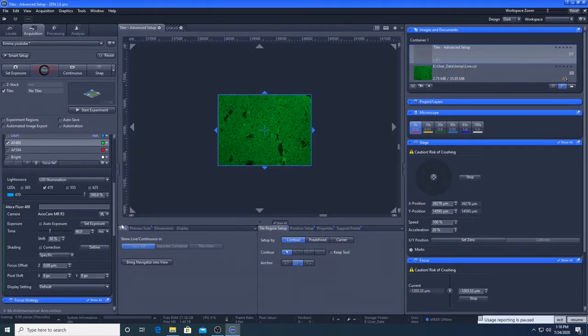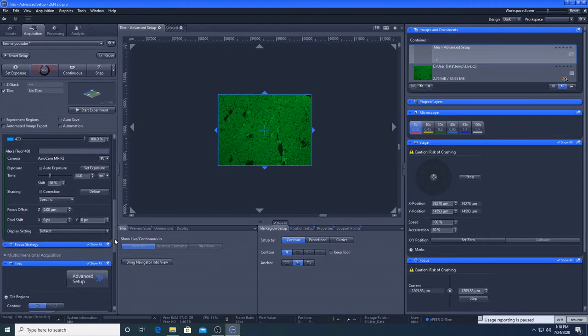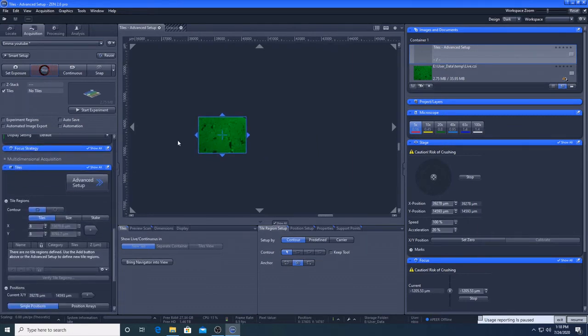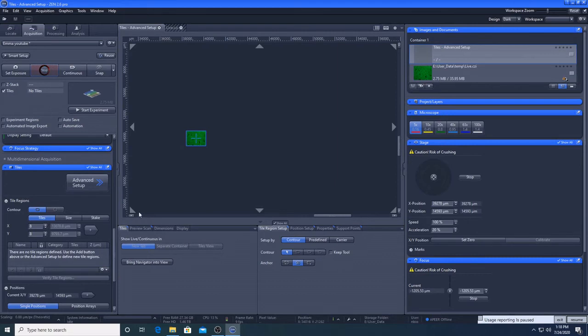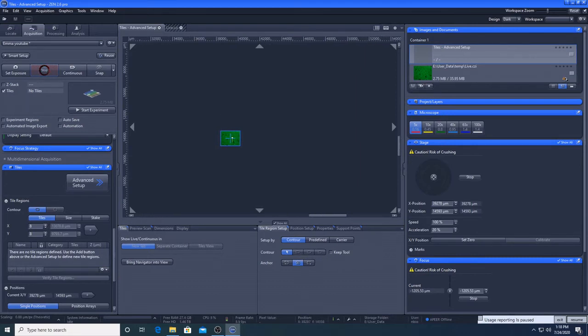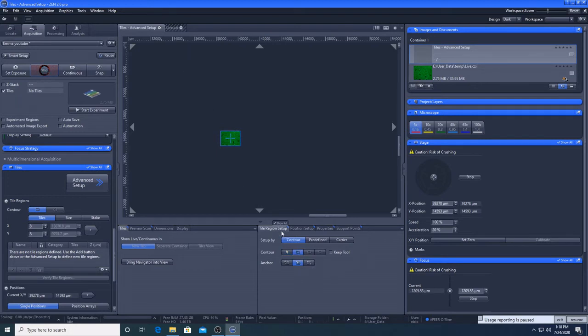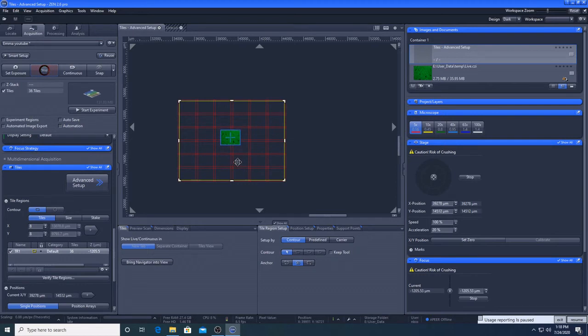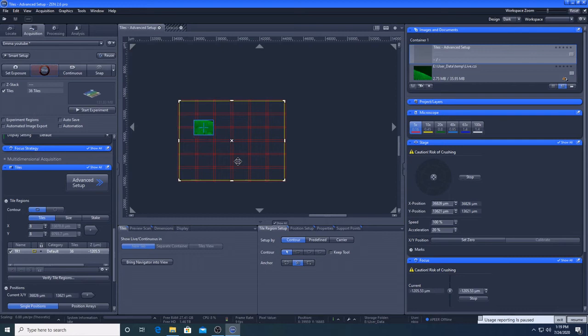So we'll go back to advanced setup here. Go back to tiles. So I'm going to zoom out with the mouse. And what we're going to do is we're going to draw a box around this area here, which is equivalent to our live window. So I'm going to go to contour down here in the tile region setup. I'm going to draw this here. So what I'm going to do is I'm going to use the settings in the microscope, the actual wheels in the microscope, to move the sample around.